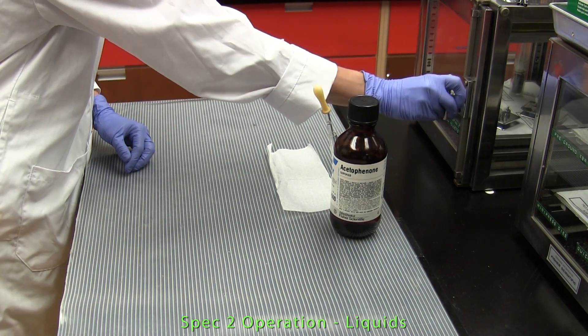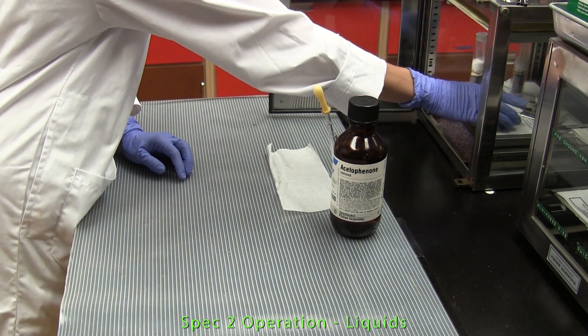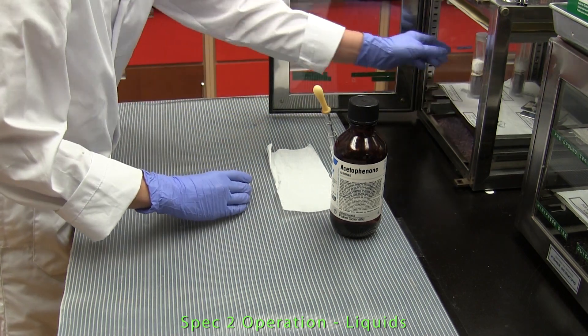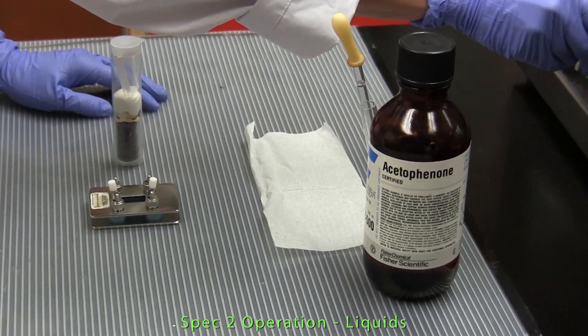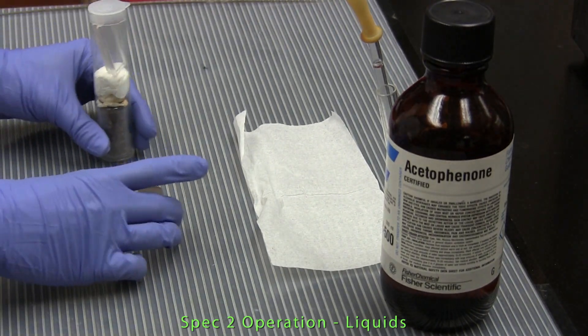For convenience, the basic instructions for obtaining a spectrum on this instrument are posted nearby. But first we need to prepare the liquid for spectroscopy. The equipment we need to do this is contained in a desiccator.